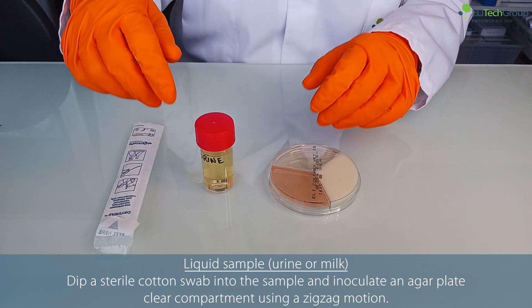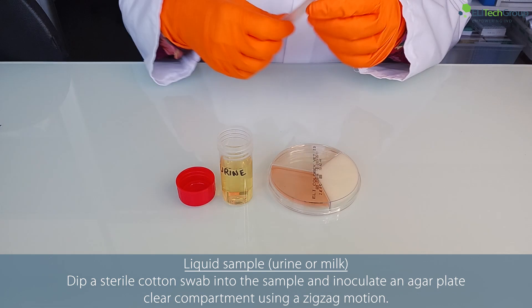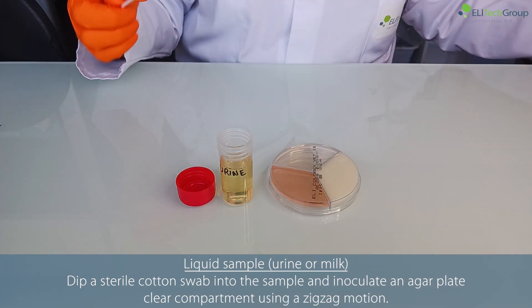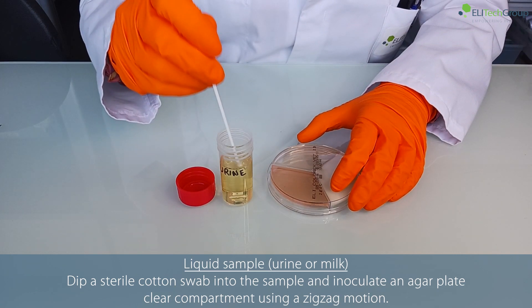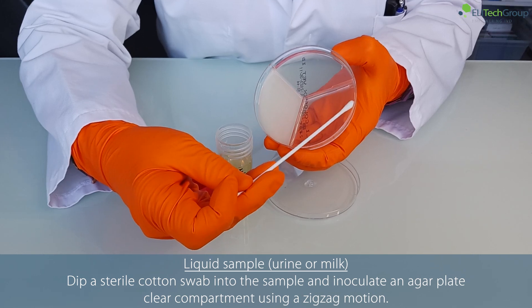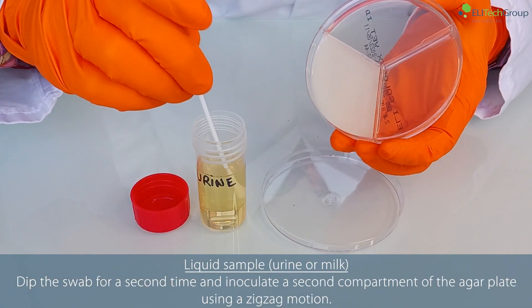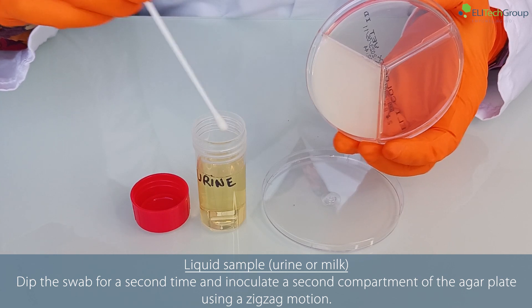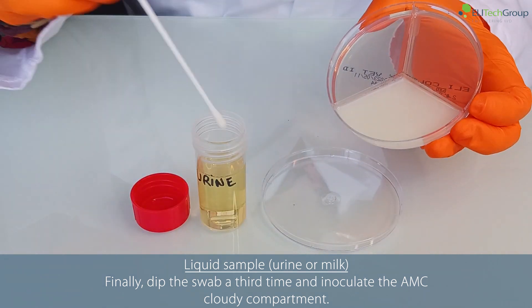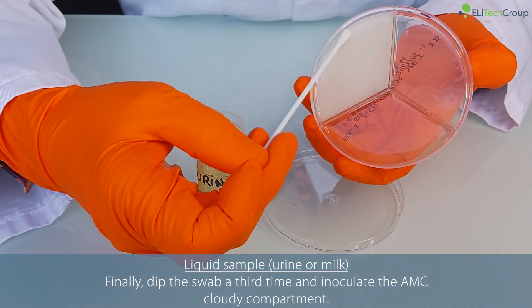For liquid sample — urine or milk — dip a sterile cotton swab into the sample and inoculate an agar plate clear compartment using a zigzag motion. Dip the swab a second time and inoculate a second compartment using a zigzag motion. Finally, dip the swab a third time and inoculate the AMC cloudy compartment.